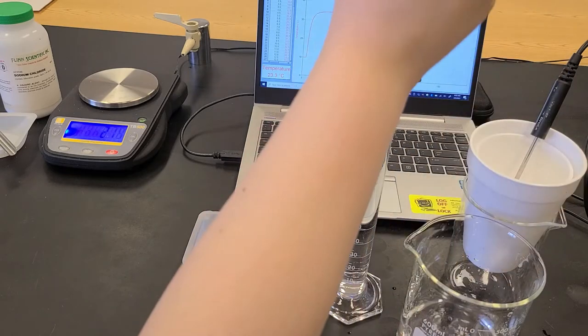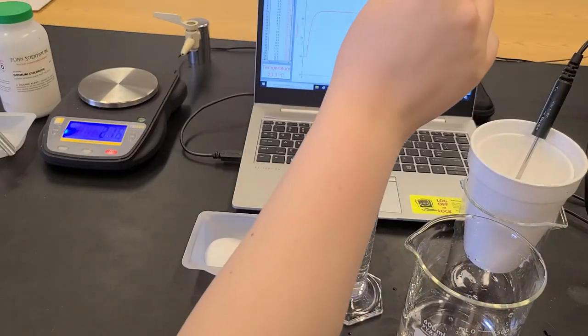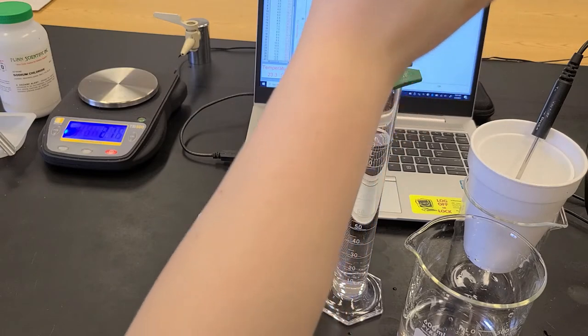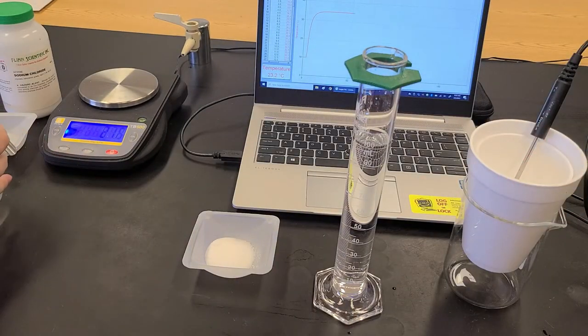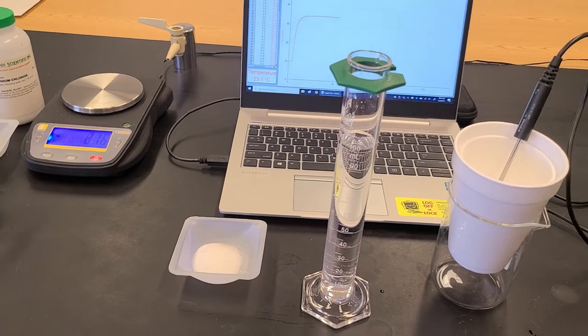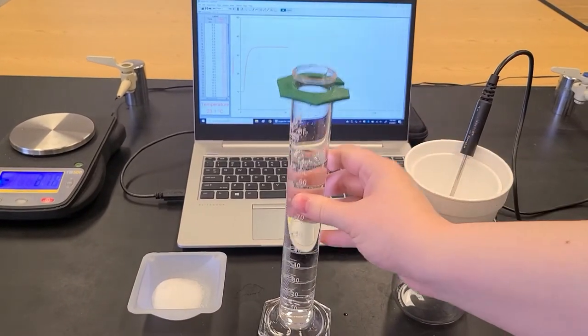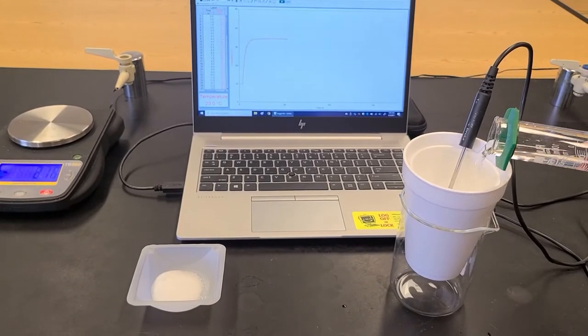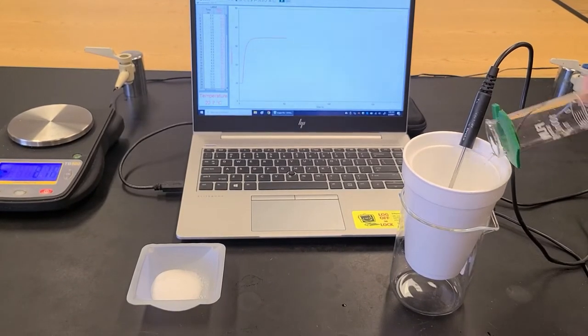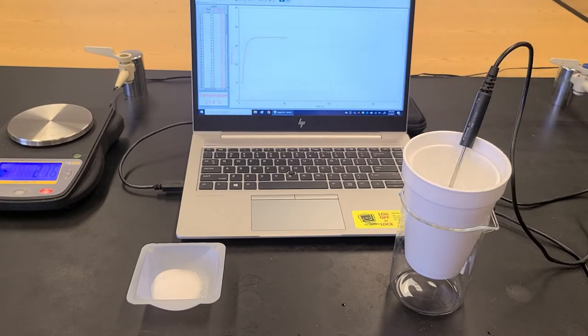Again, in your data set I believe it's 45 milliliters. So I'm going to take my distilled water here and pour it into my calorimeter. I've grabbed a beaker to put it in just to kind of stabilize it so it doesn't fall over. So I'm going to add this water. And then I'm going to want to start collecting temperature data so I'll know the initial temperature of the water.